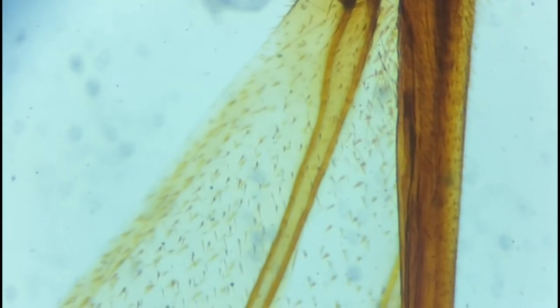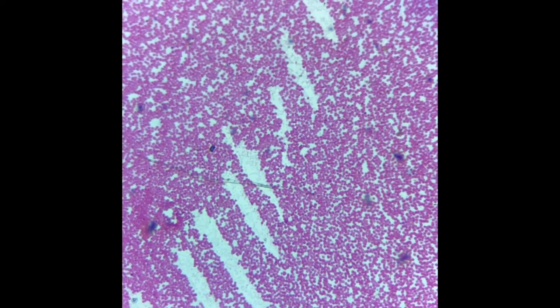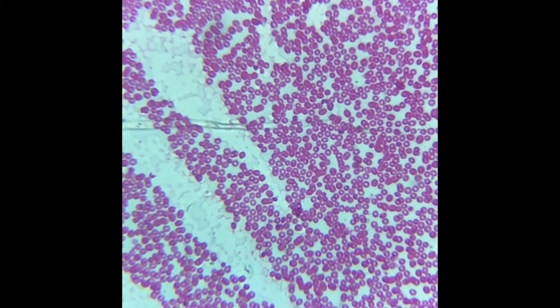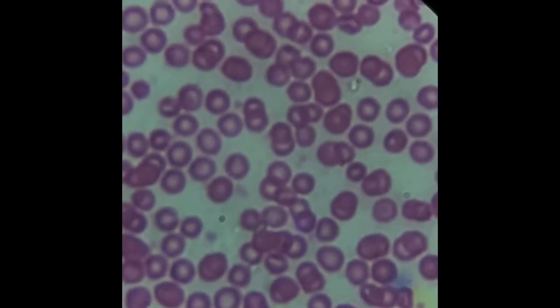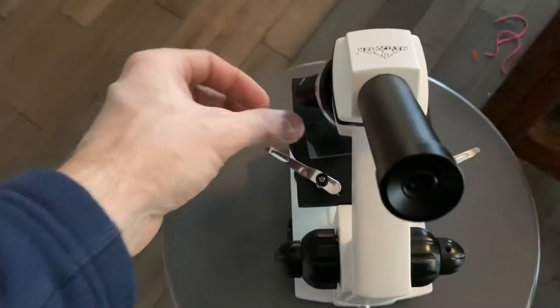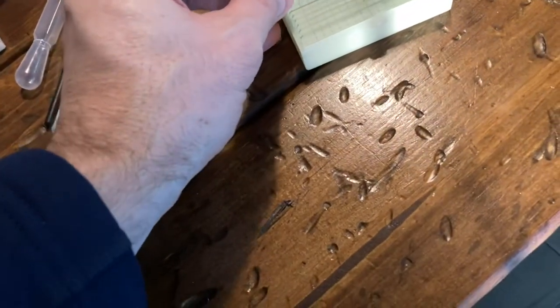Look at that — you can actually see the little micro-hairs or spikes. Now let's look at a human blood sample, also included in the slides. At the least powerful setting, then increasing to medium power — I think it's around 10x. Then at full power, we lose a little bit of light and it's harder to focus at super high power, but overall it's really nice detail if you can get it to where you want it. I'm not entirely sure what the blood cells are supposed to look like, but you can see the power of the lens.